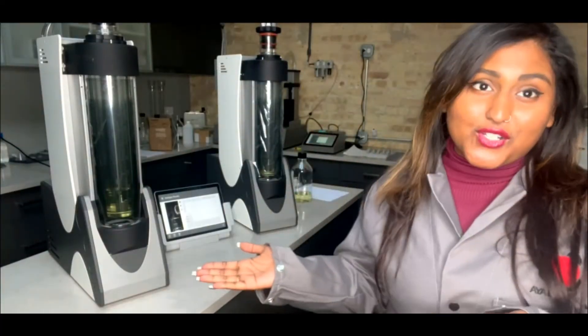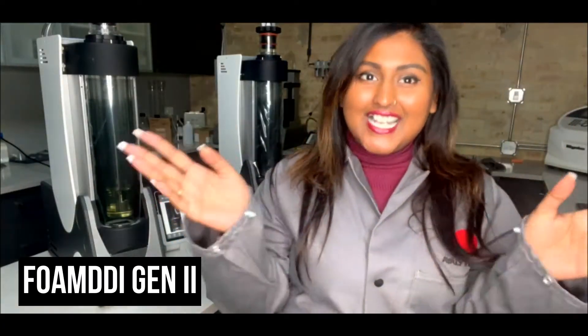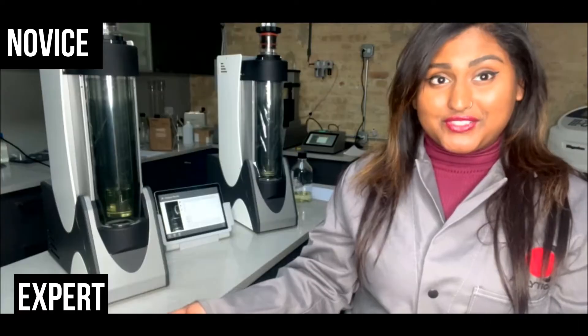Today we're going to be talking about our Foam Diddy Gen 2. It is the foam digital detection imaging which is used for novice to expert levels.